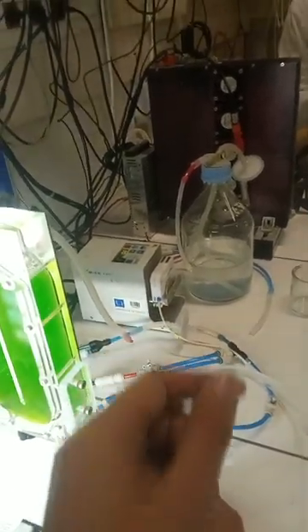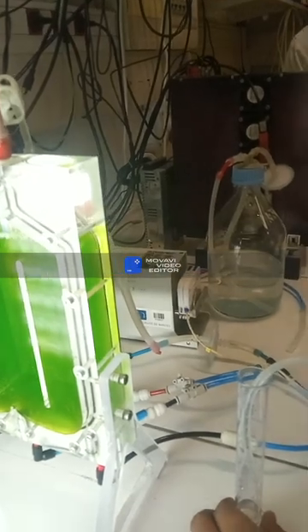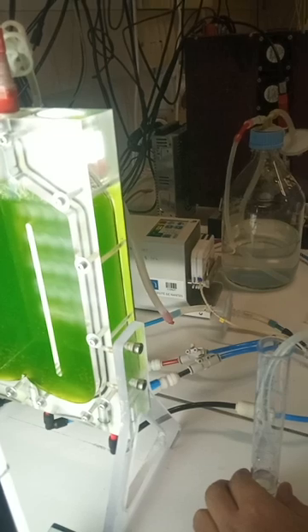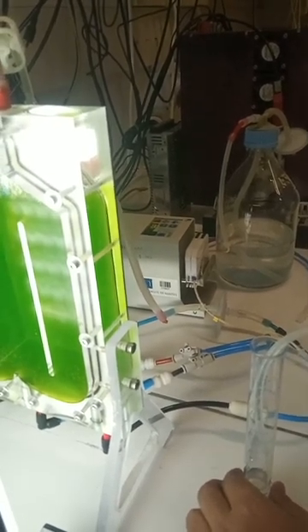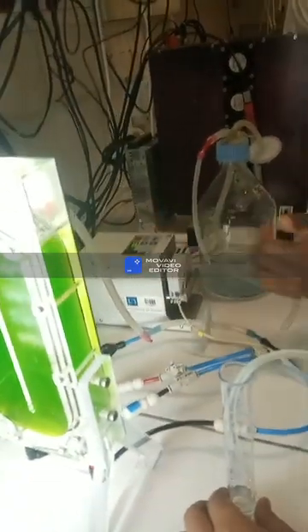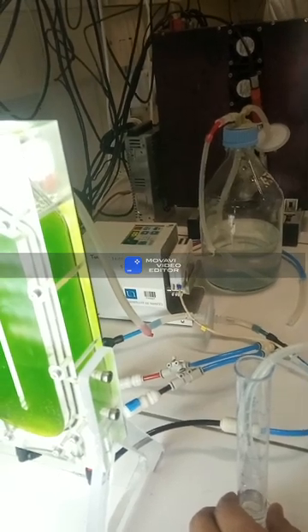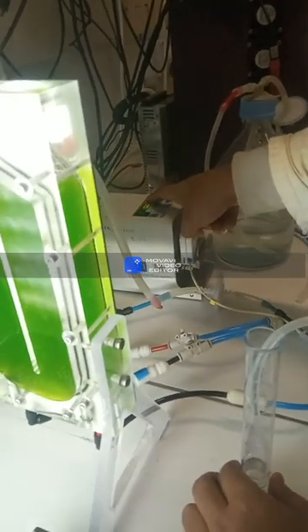Normally 1 minute, you can do less, but it depends on the flow rate. If you have a high flow rate, you can decrease the time. Often 1 minute, but you can do more. Because if the flow is at a minimum, we will wait maybe 1 hour, 2 hours.